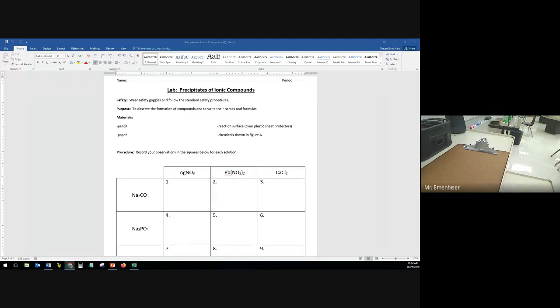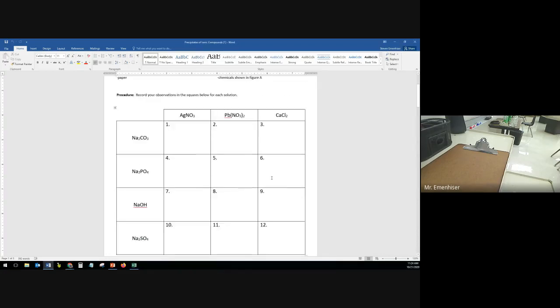Okay, guys, this video is going to be over the lab of precipitates of ionic compounds. We covered chapter 4, so I want to do a lab where you can see precipitation reactions and predict the products of them. So let's see. Lab: precipitates of ionic compounds. And what we're going to be doing is essentially this right here.